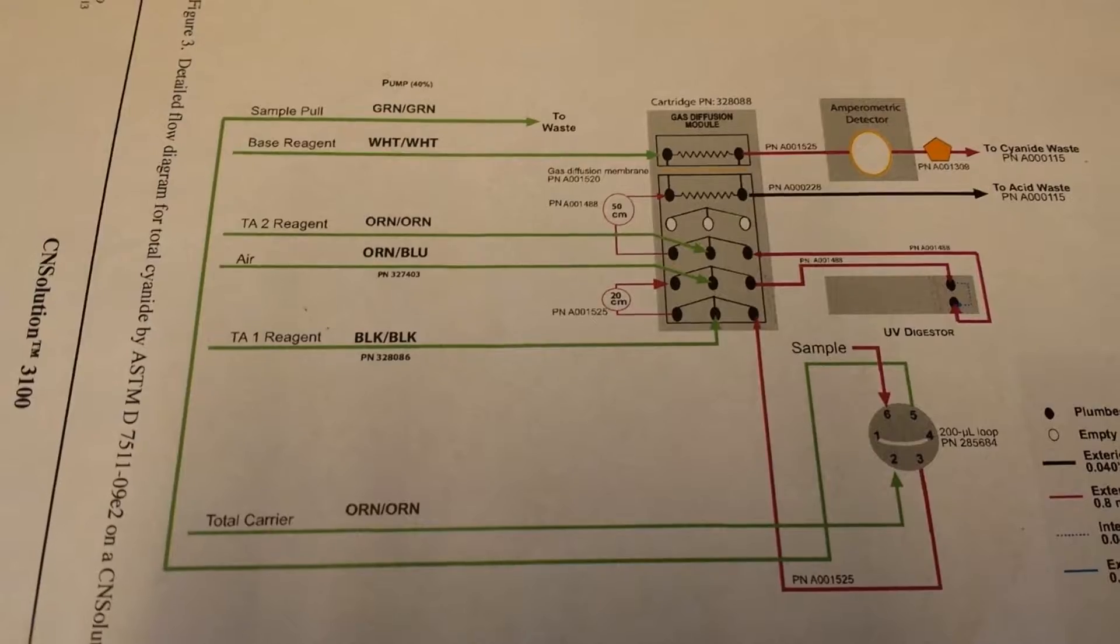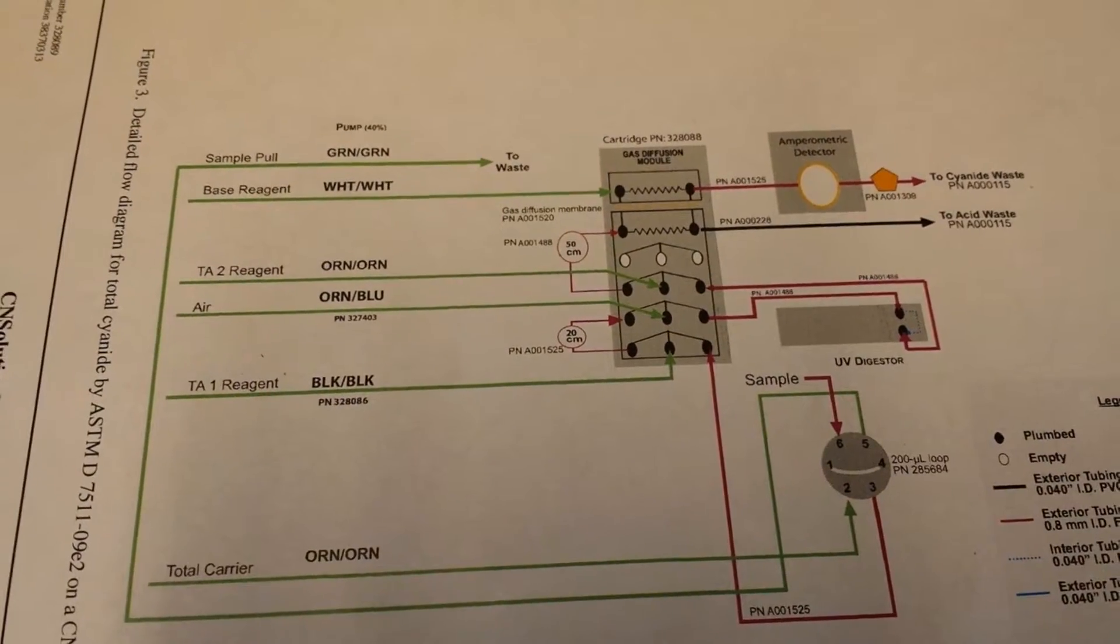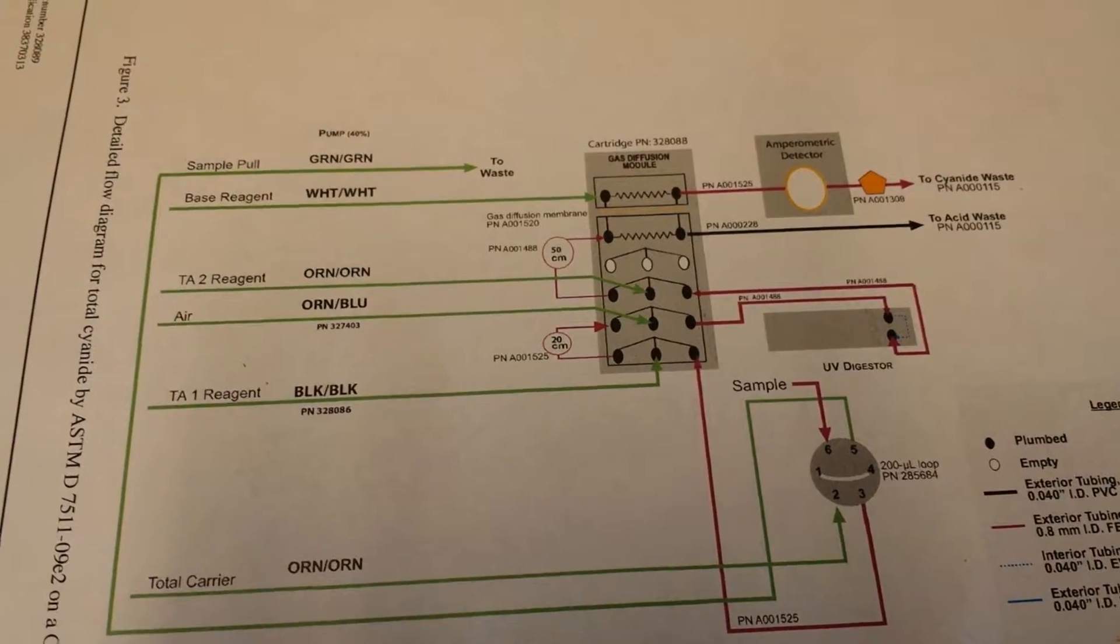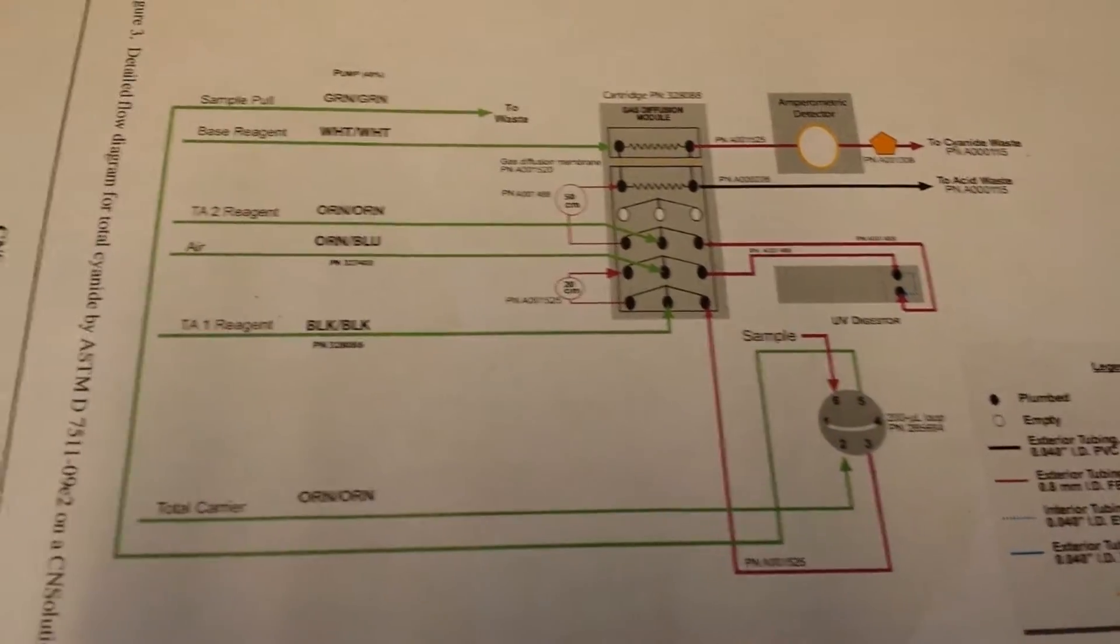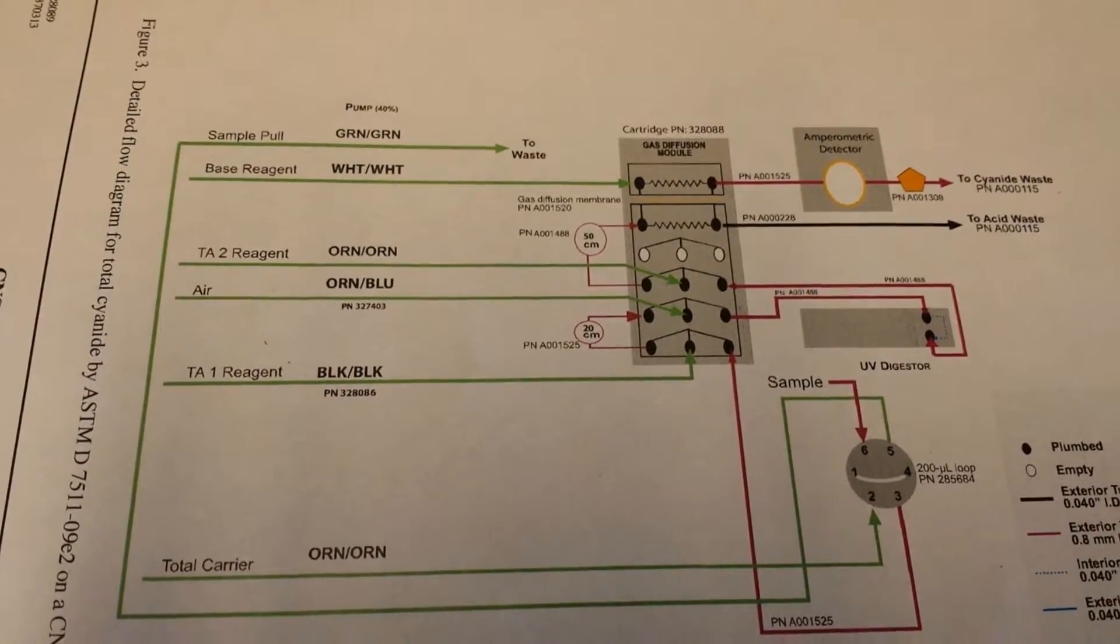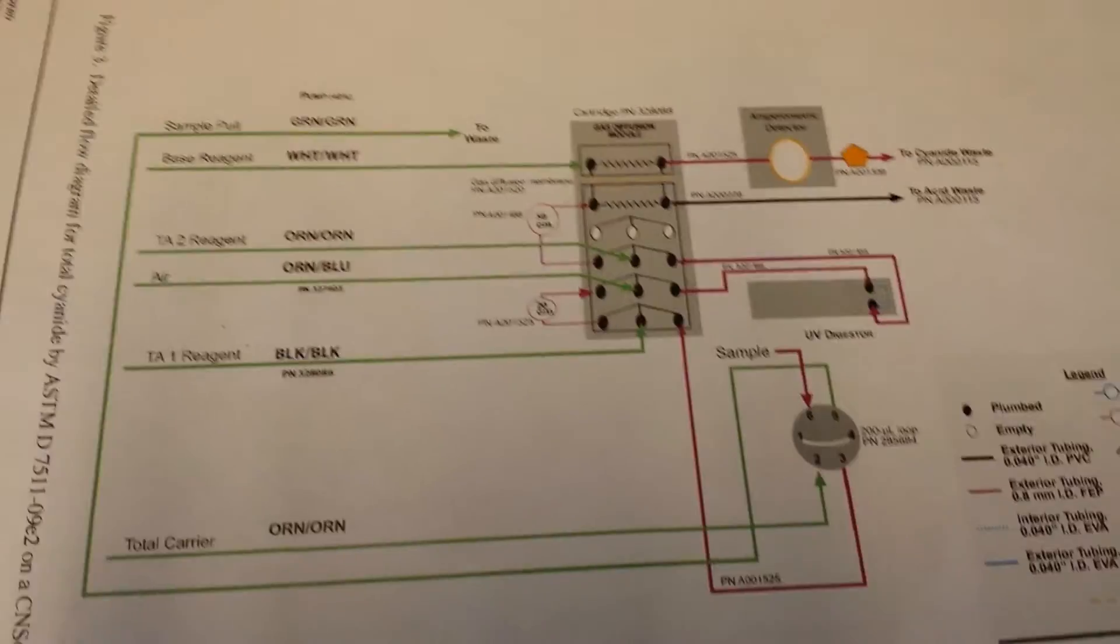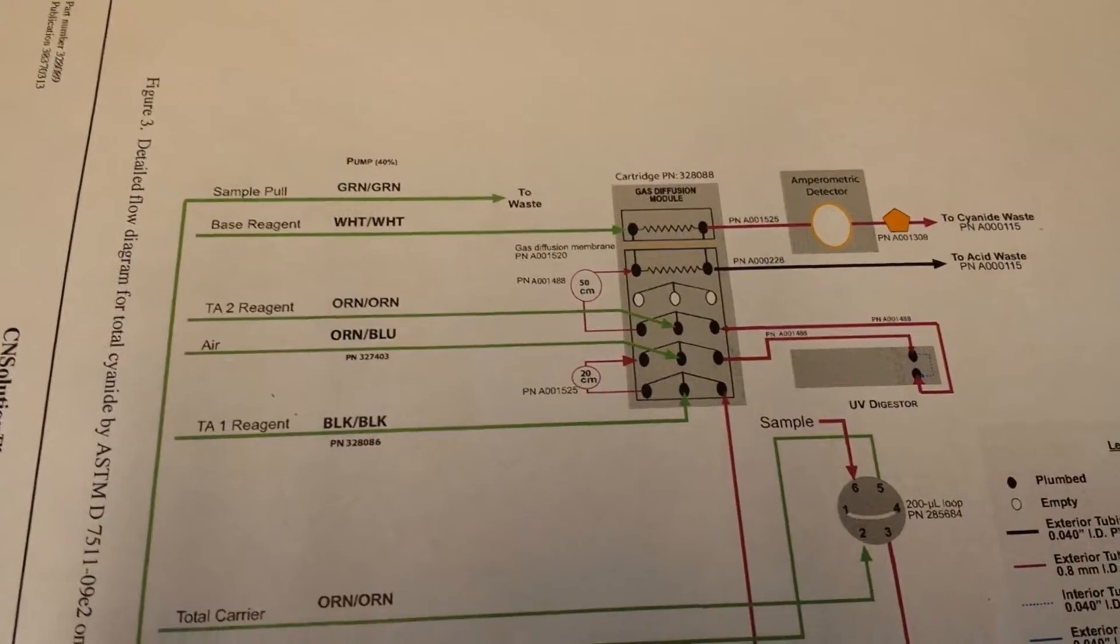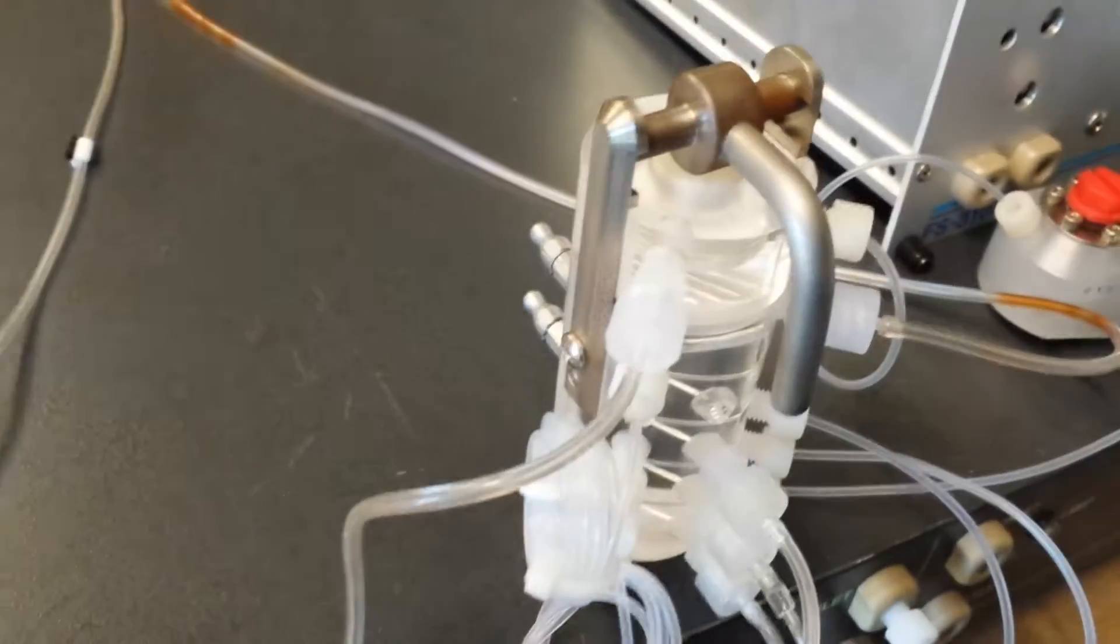Right now it's plumbed with Total, which uses the black tubing for TA1 and then a small orange-blue airline. It sends it off to the UV digester, returns and gets orange TA2, and the base is being pumped across the top of the gas diffusion module.